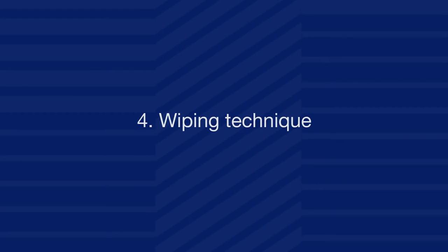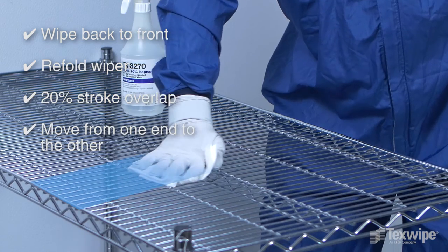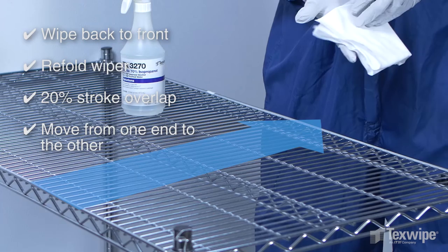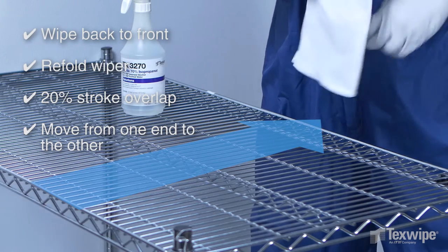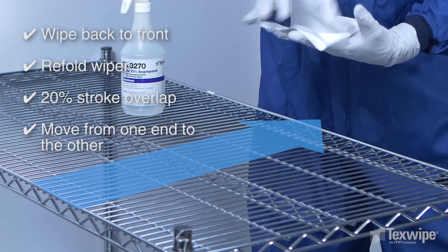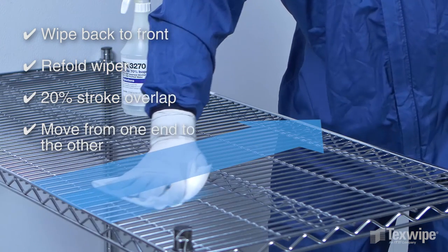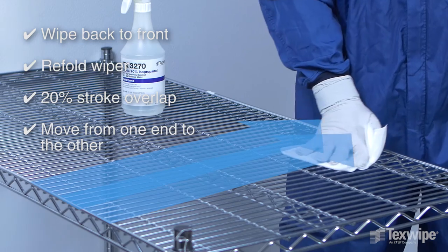Step 4: the wiping technique. Start by wiping the shelf top from the back toward the front in one direction. Refold the wiper, then wipe the surface again with a 20% overlap of the previous stroke. Wipe from one end to the other in one direction.